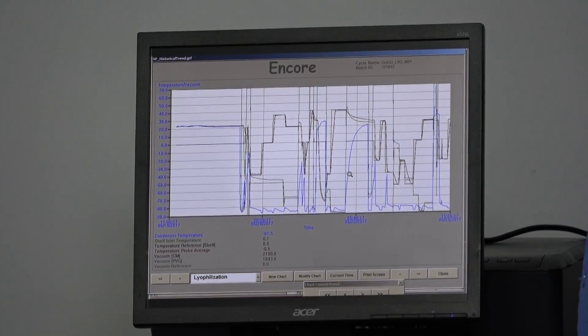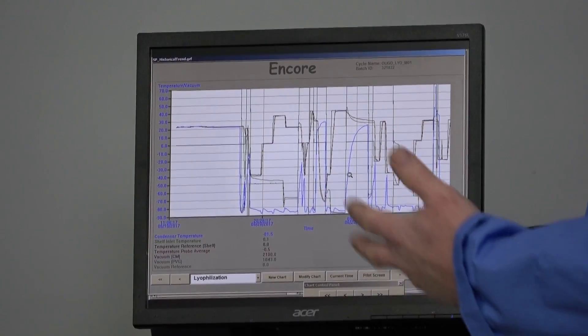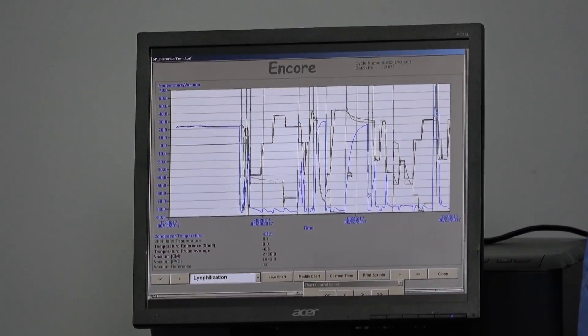I went through the whole history and added up the hours — it is under 400 hours of use. That coincides with the chiller as well, which also has under 400 hours. It's a nice feature to have absolute hour tracking on this machine.